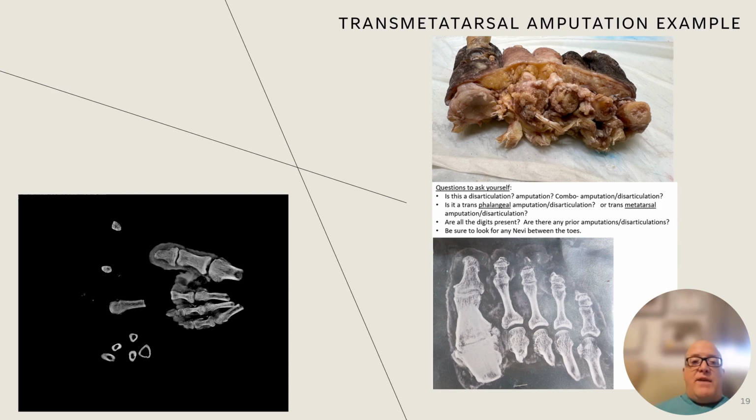But sometimes you can have an aggregate of tissue where you have multiple segments of bone or disarticulated bone. And you're like, oh man, how am I going to figure this out? Then you have to get into the op notes, but instead you can put it into the system, radiograph it, and then you can go over your anatomy and be accurate and be efficient.